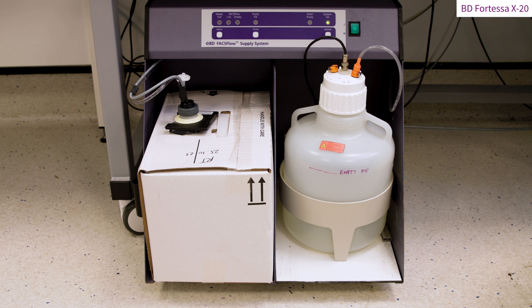At the start of acquisition, check the waste tank, which is located on the right-hand side of the fluidic cart, that this tank is sufficiently empty for your run.